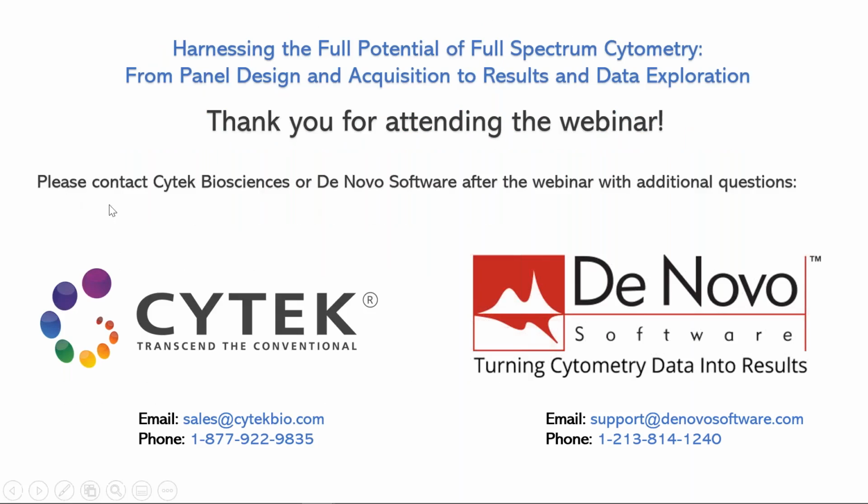So with that, I know we've covered a lot today, moving from the full spectrum cytometry panel design and acquisition, covering and moving out to some results and data exploration in FCS Express.